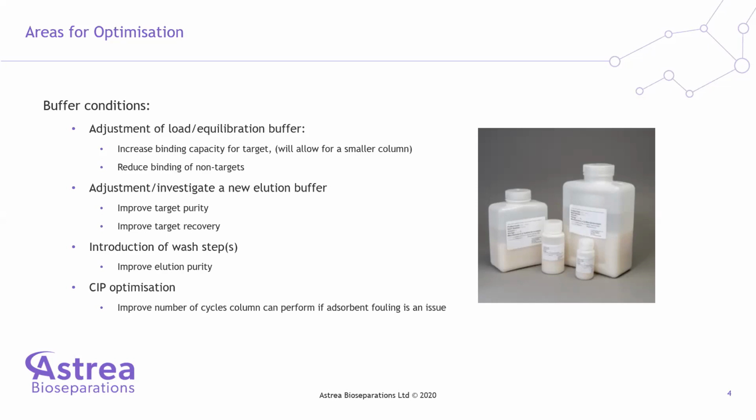The final buffer step that we can optimize is CIP. Here we'll perform this if fouling is an issue and it's potentially affecting the number of life cycles you're getting out of your adsorbent. Here we would look at a range of different CIP solutions, and that could be used in combination with multiple different solutions or in combination with hold steps as well.